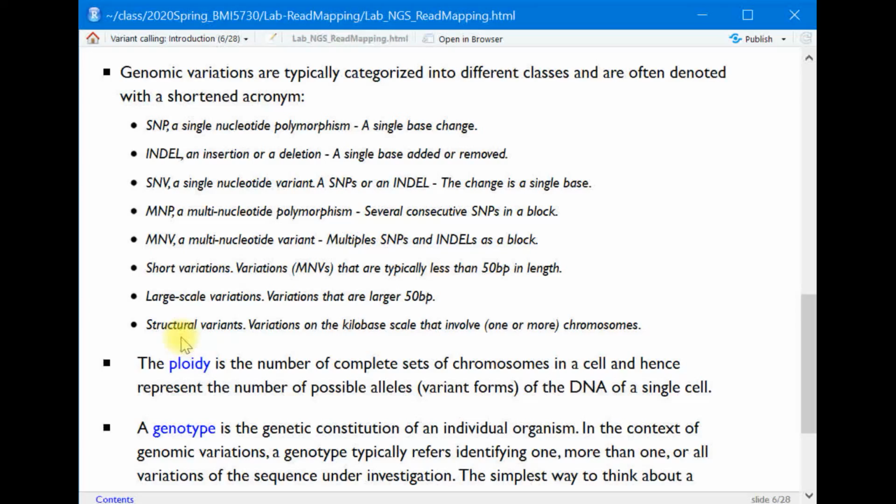So in the variant calling process, we'll run into some terminologies that are not always used consistently. So we'll attempt to define a few of these terms, but please note that those definitions are not necessarily textbook definitions designed to accurately capture the proper terminology of genetics as science, but our definition is more like what people call certain features of their data.